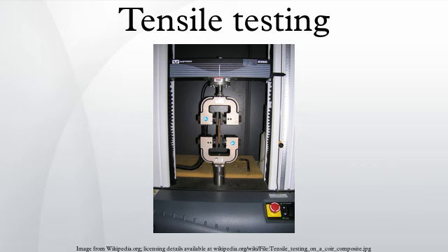Process. The test process involves placing the test specimen in the testing machine and slowly extending it until it fractures. During this process, the elongation of the gauge section is recorded against the applied force. The data is manipulated so that it is not specific to the geometry of the test sample.